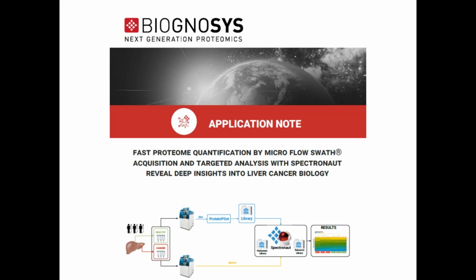Thanks for that. The next two questions are related. The first is how we selected the normal tissue. Here, the selection of the tissue type was done by the provider of the tissue, where we basically just ordered healthy versus cancer tissues, and it was done by the pathologist.